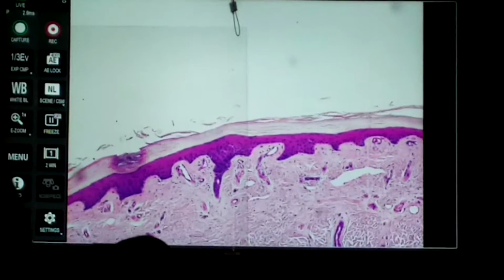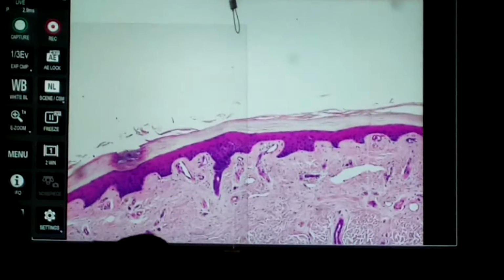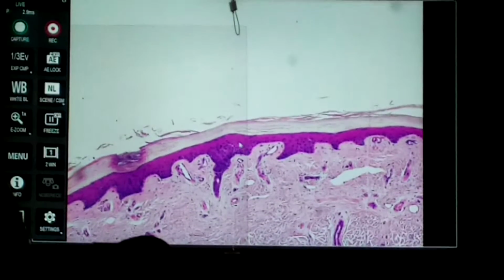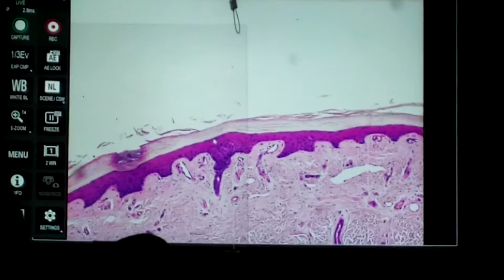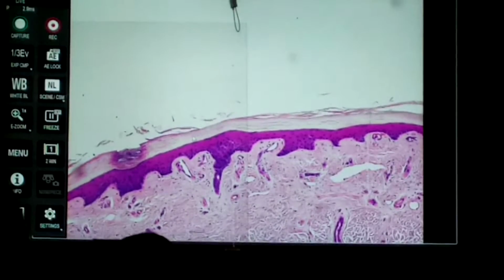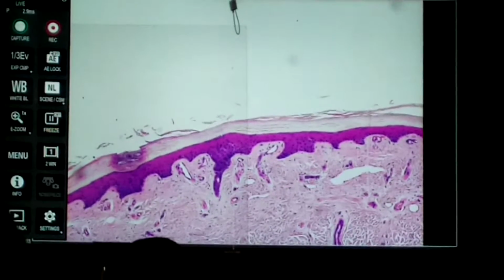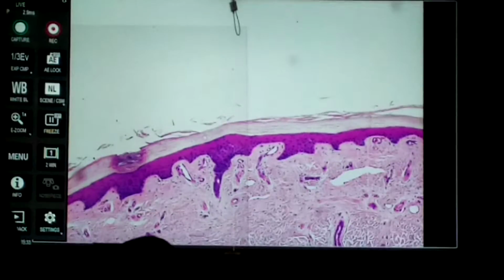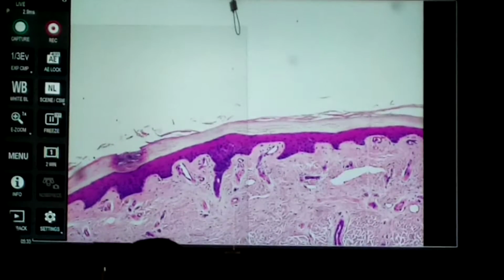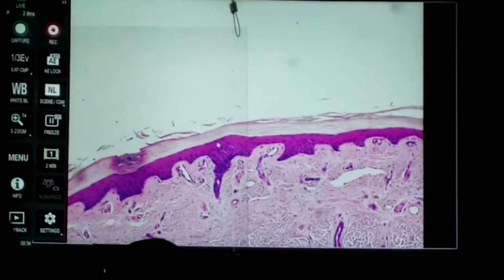Yeah. So you see multiple layers of cells. The basal layer here is kind of cuboidal, but as it moves up, the nuclei become flattened. And then the nuclei up here disappear. As the cells lose all their distinguishing characteristics, they just become a bag of keratin, one connected to another. So these are like strands of keratin that are beginning to break down here. But this is keratinized stratified squamous.